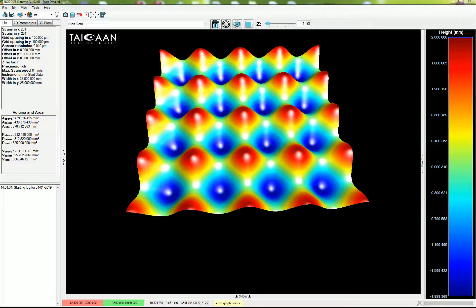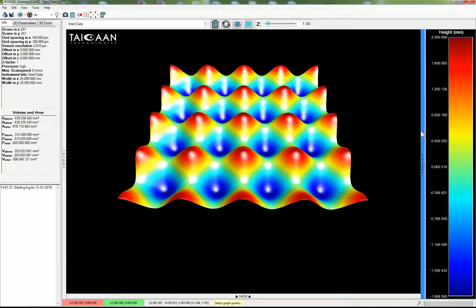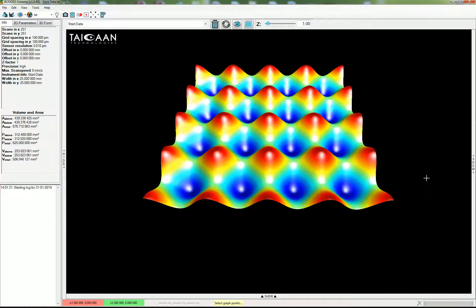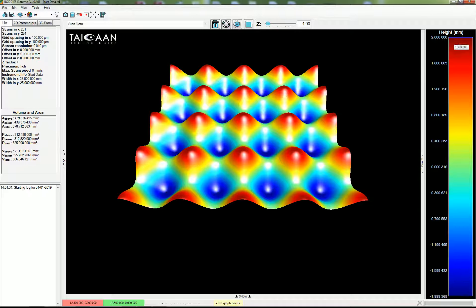Let's come back to this black space, which we call the image space — it's basically where the three-dimensional data is rendered and you get a presentation of the surface. To the right you can see a bar, now highlighted in blue, which can be hidden or shown. This is the colour scale representing the data in the image space, running from red at plus two millimeters through to blue at minus two millimeters, reflecting the heights of the three-dimensional surface.